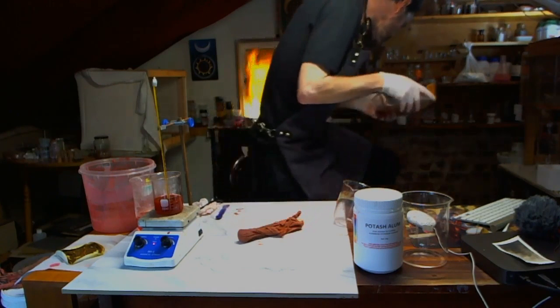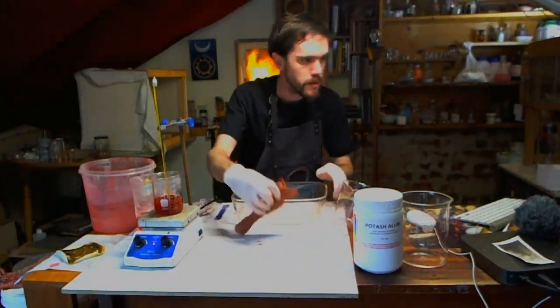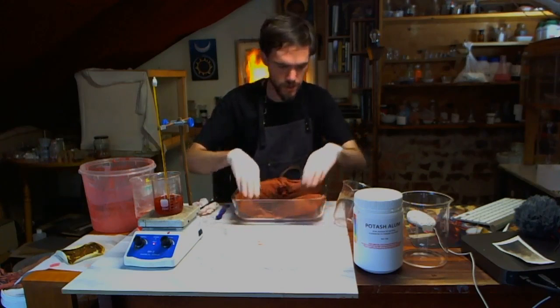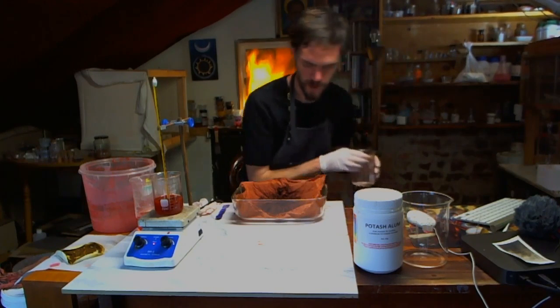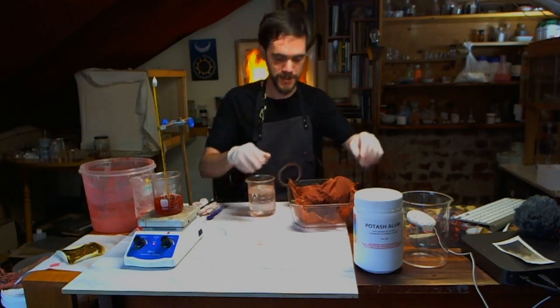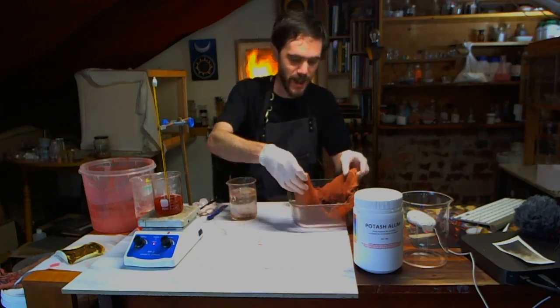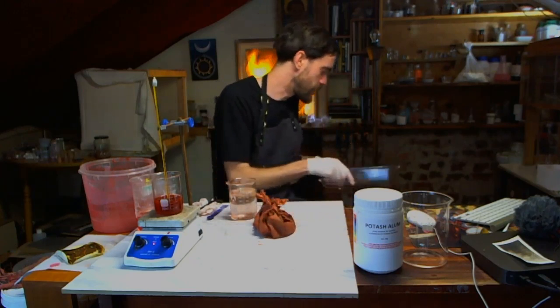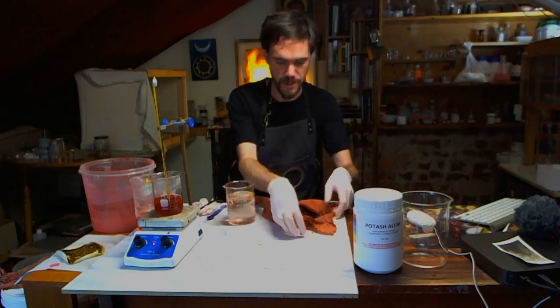Again, let's get rid of this. Let's do another wash here. What I might do, I'm gonna have to do a stream on the copper carbonate. Everybody seems to be more interested in that. Yeah, so I don't think it matters what you use as long as you start with copper nitrate. I think that's the really important part.